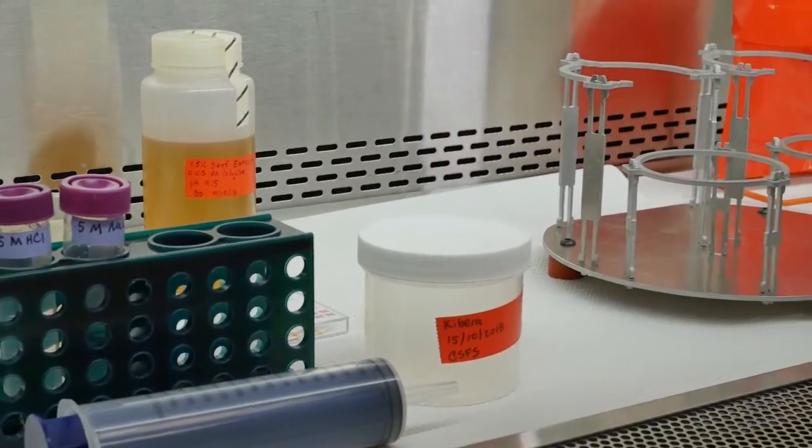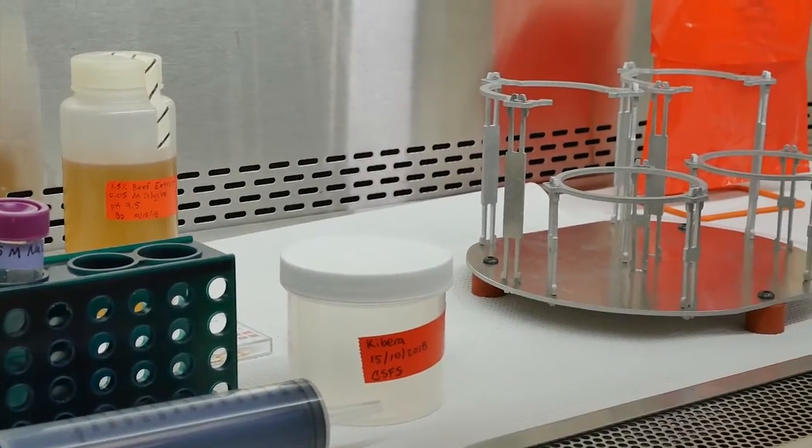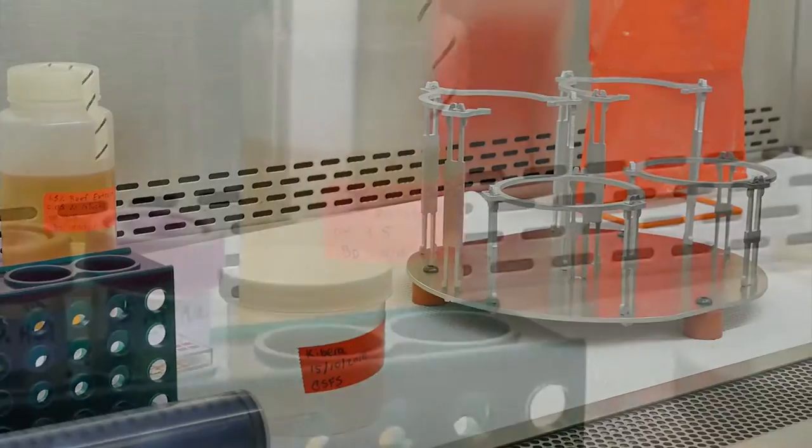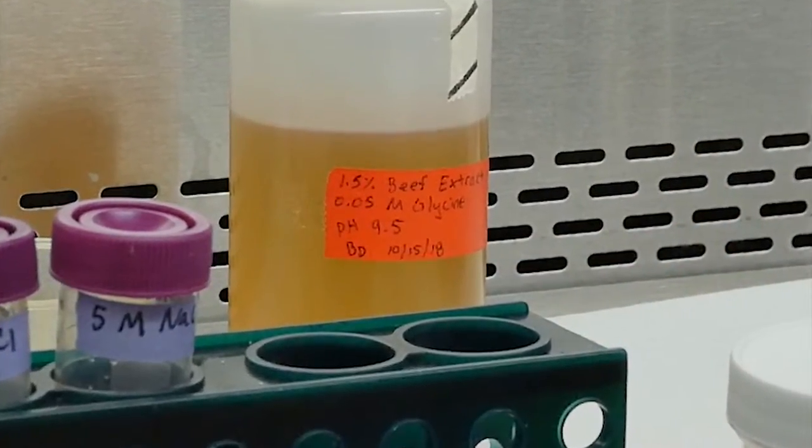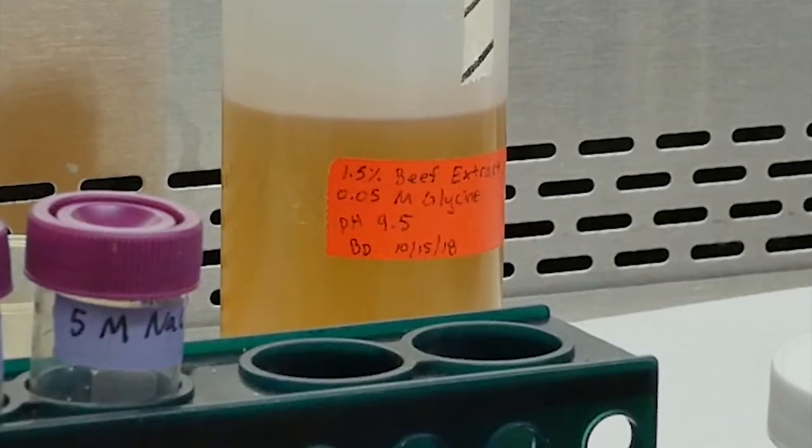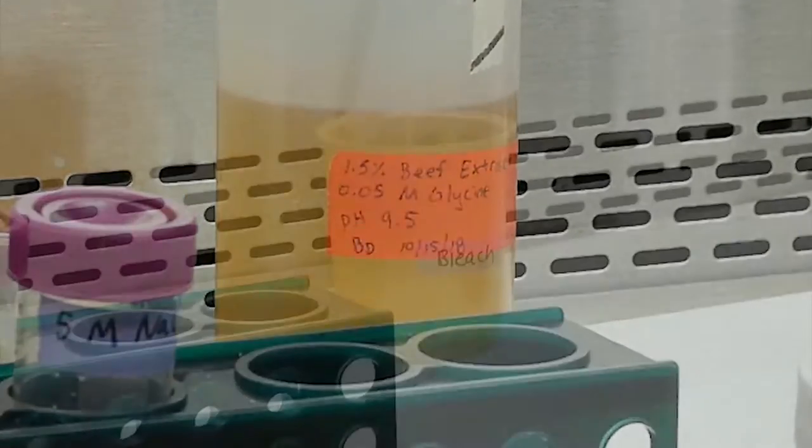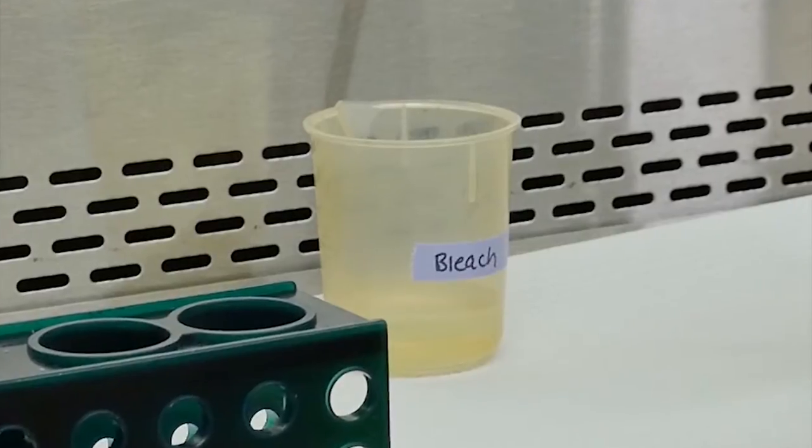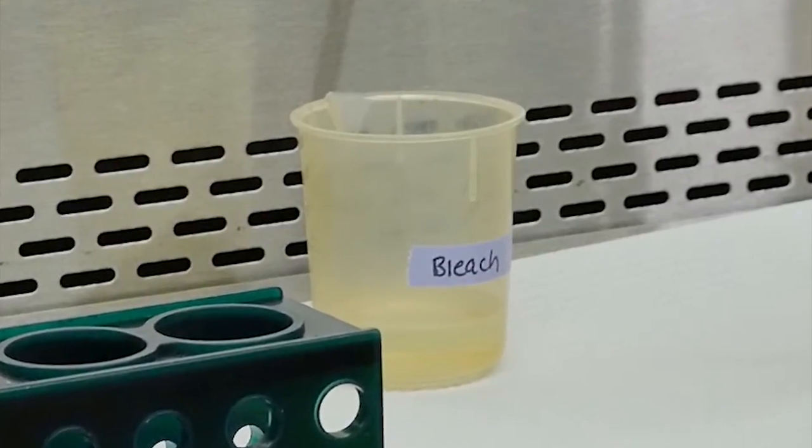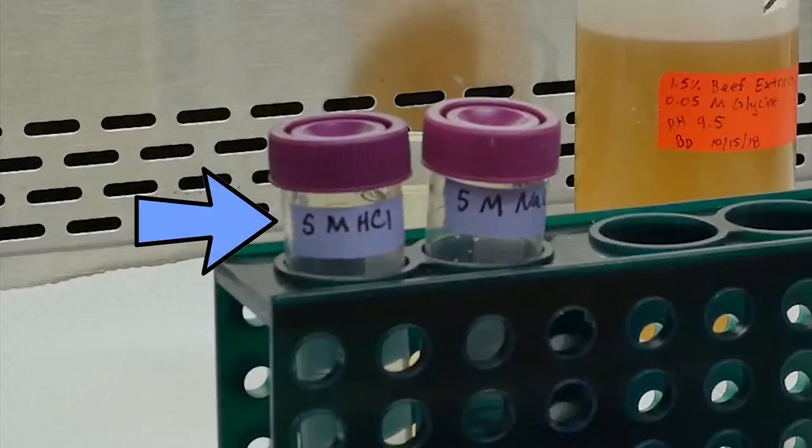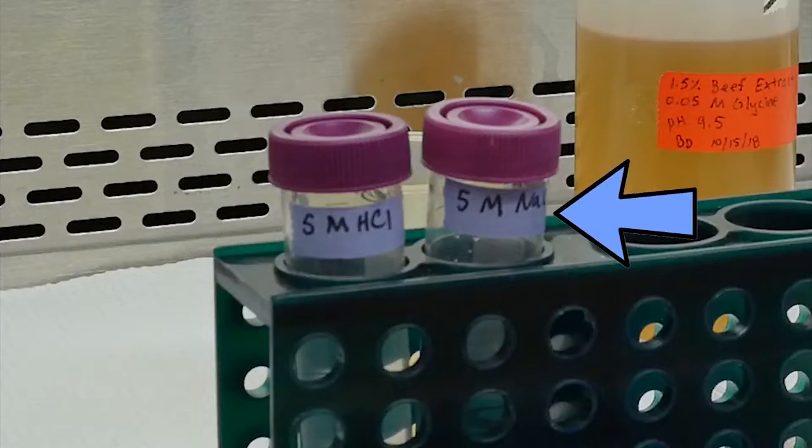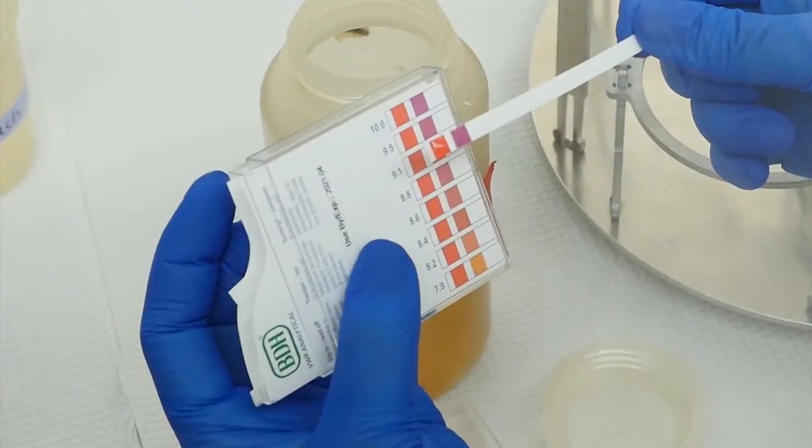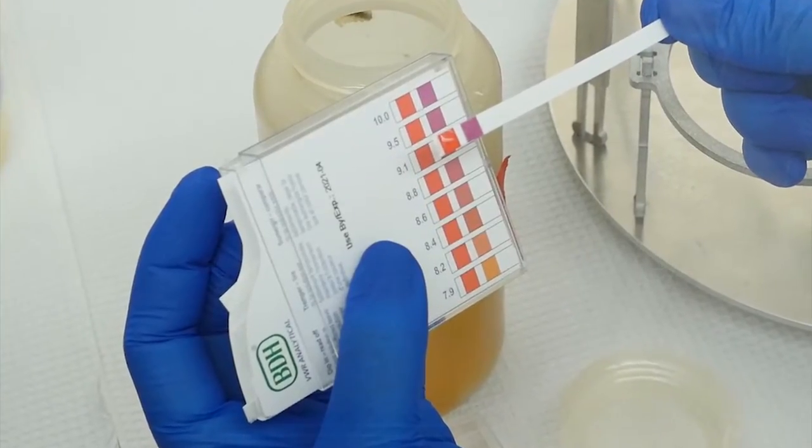You may then place the reagents and materials inside the biosafety cabinet including 300 milliliters of sterile 1.5% beef extract with 0.05 molar glycine at a pH of 9.5, 50 milliliters of concentrated 5% bleach solution in a small beaker, 5 molar hydrochloric acid, 5 molar sodium hydroxide, and pH strips with a range of 6.0 to 10.0.